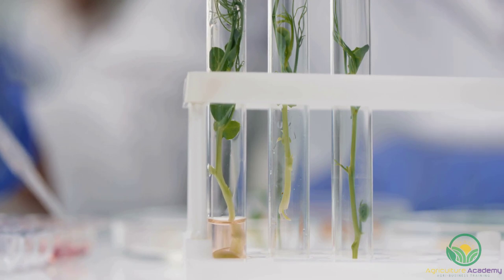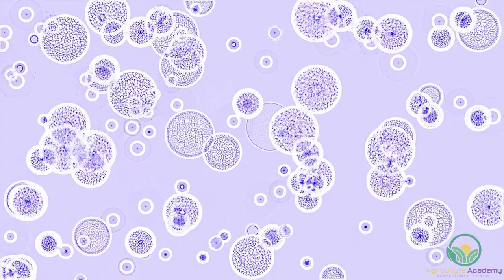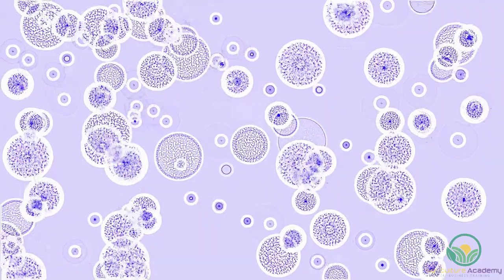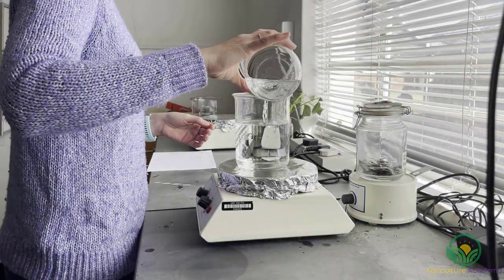Tissue culture is an inclusive term for the range of procedures used to establish, maintain and grow plant organs such as embryos, shoots, roots and flowers, as well as plant tissues like cells, callus and protoplasts in an aseptic or in vitro culture.